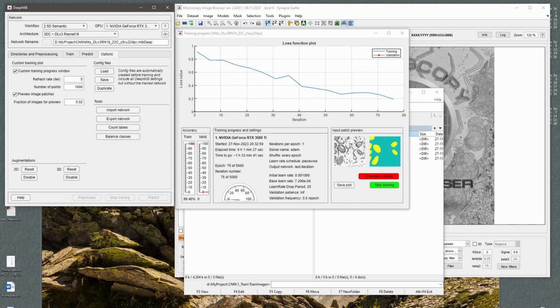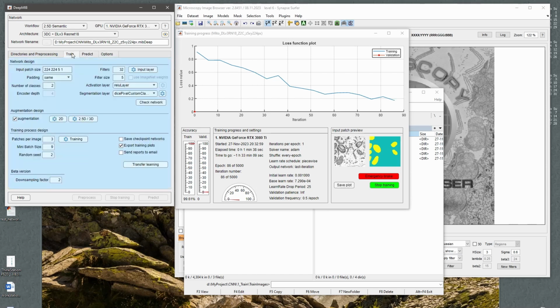If you know that everything works fine, then it makes sense to drop this value. Now it's 2%, but you can make it even 10 times lower or more. Let's train for a couple of minutes, and see what the result will be.